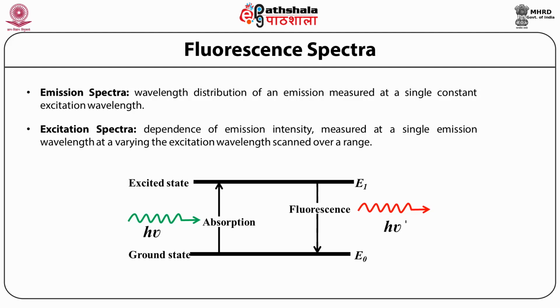Such identical absorption and excitation spectra are rarely observed because the excitation intensity is different at each wavelength, and because of the properties of the fluorophore, a nonlinear response resulting from a high optical density of the sample, or the presence of other chromophores in the sample.